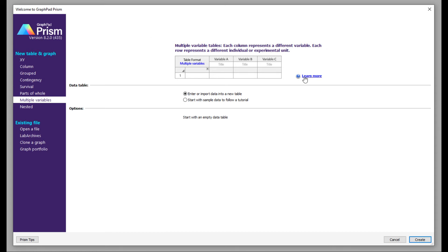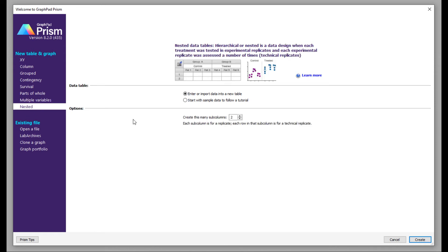Then you have nested plots. You can use nested plots when you have a number of different variables and want to plot all those variables separately. Nested data tables are designed for when each treatment was tested in experimental replicates and each experimental replicate was assessed a number of times. When you have multiple experimental data for one particular experiment, nested plots are really handy and very informative. You can specify how many replicates you want to show and they will be displayed separately.